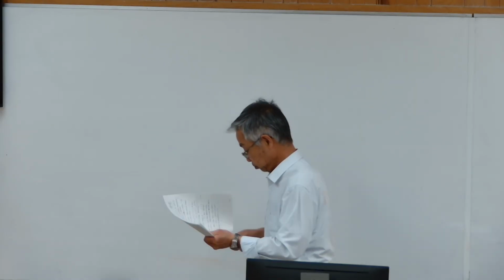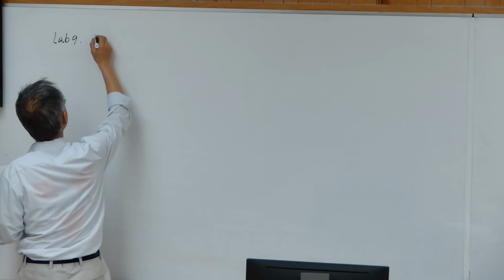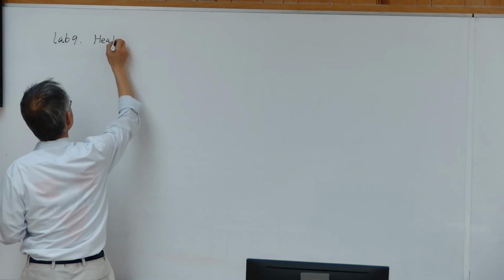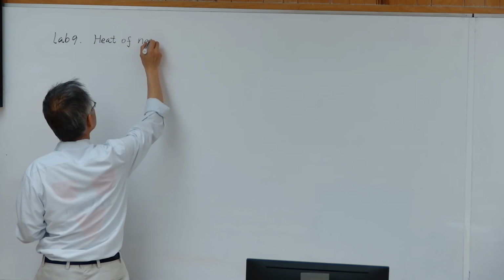Okay, today we're going to do experiment 9. Lab 9 is to determine heat of neutralization.